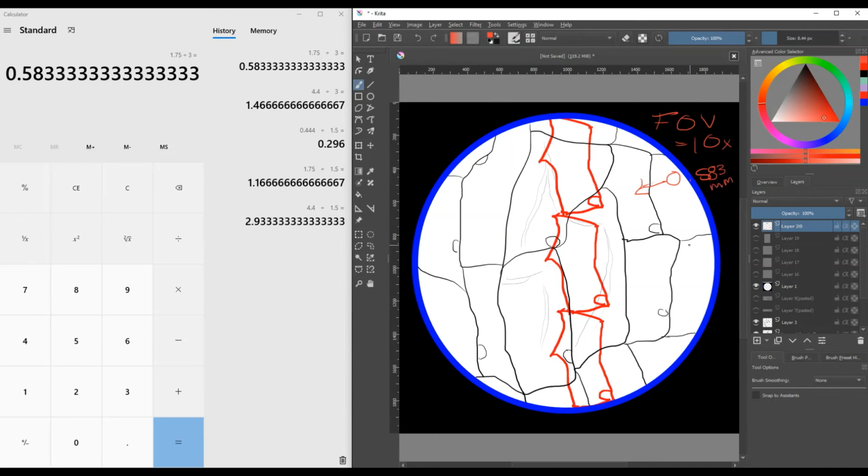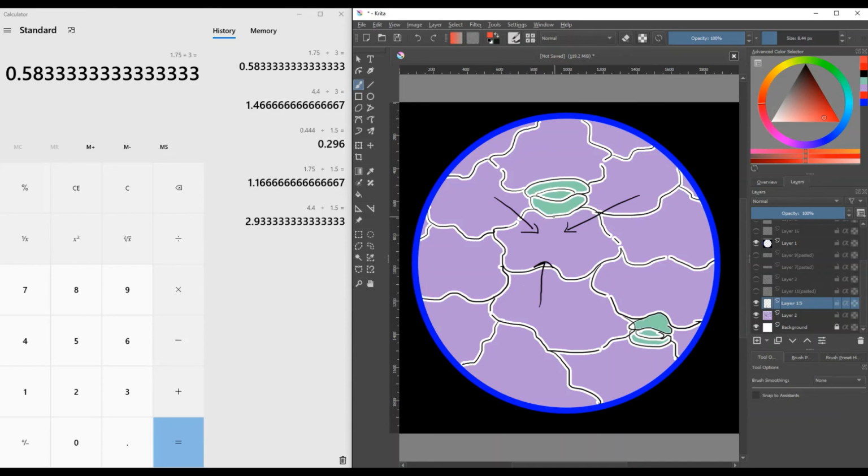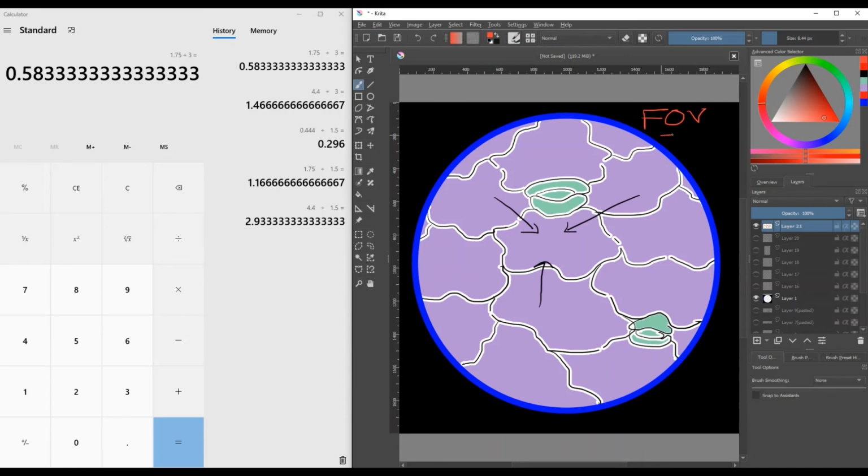After this, I'm going to leave you with an example for you to try on your own. You're going to try measuring this coral bell leaf, and it's going to be this cell right here with the arrows pointing towards it, and the objective lens you're going to use is a 40 times objective. Now you can get back to me with what you think the answers are, either this week, next week, anytime during our discussions. And if you have any questions, feel free to ask me.